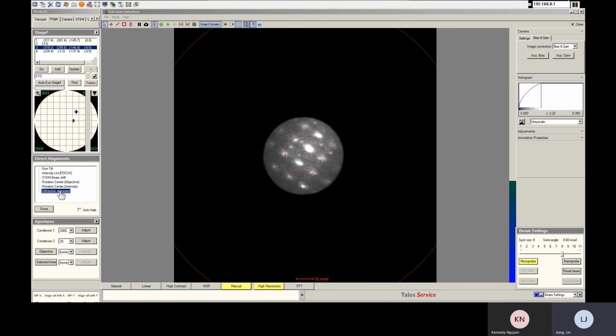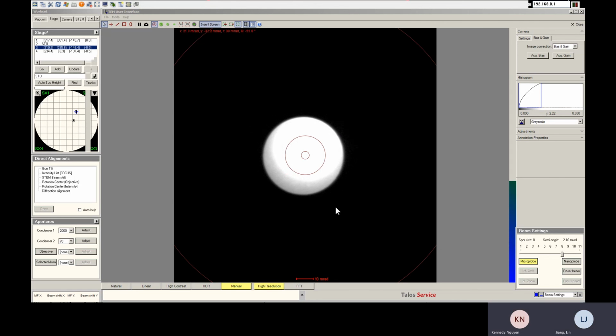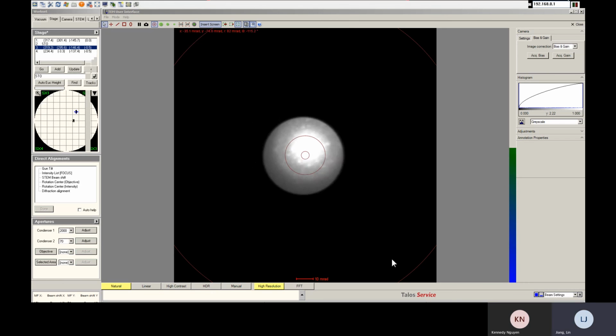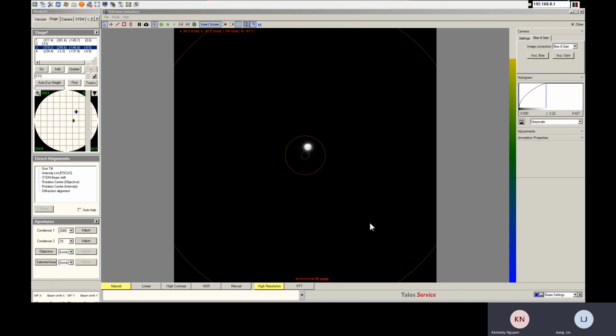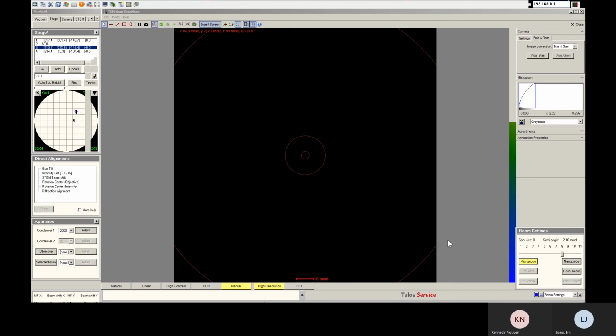Right now you have the detector in. If you want to take your microprobe image, use C2 at 20. Probably go 70. Let's give you larger. If you go 70, the spot is larger. So probably I go 20.